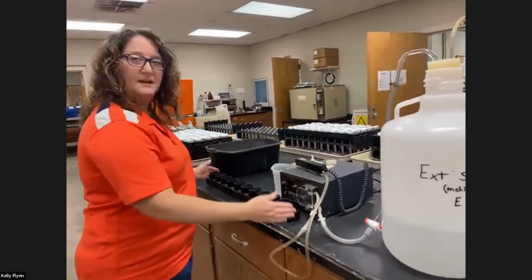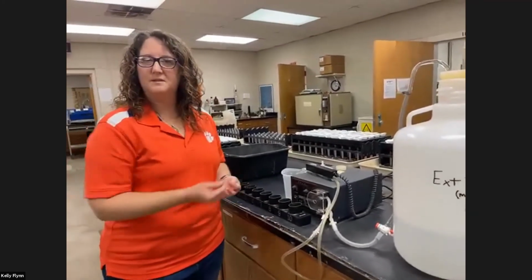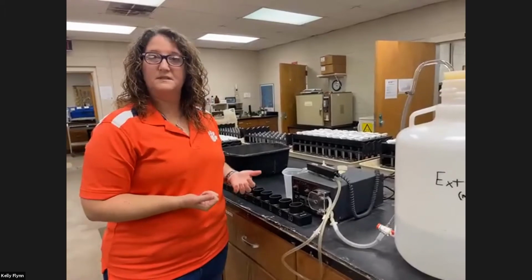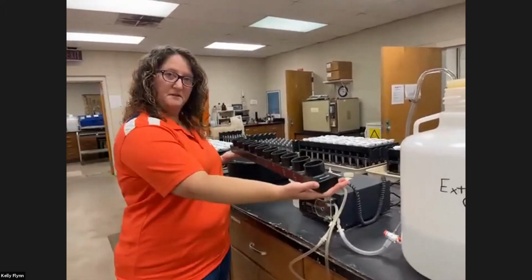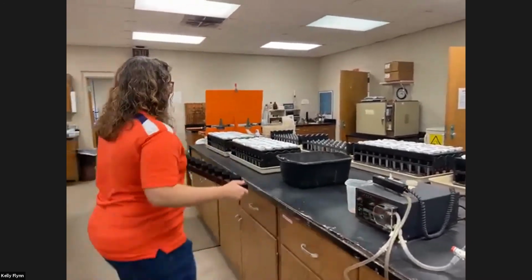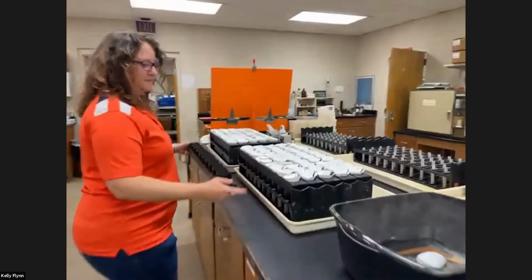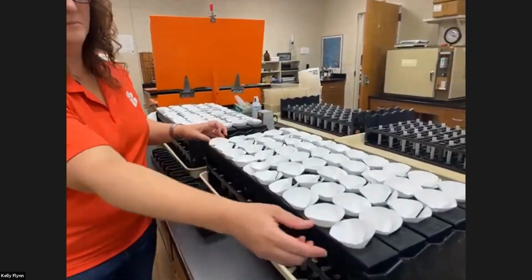And then we're going to shake this in our shaker system. So it's like an incubation process to pull out those nutrients from the solid into a liquid solution. So imagine these cups are full of a slurry of your soil and your extraction solution. Then we're going to move over to these setups, which have a filter in a built-in funnel.